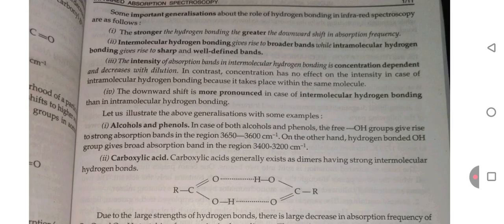Intermolecular hydrogen bonding gives rise to a broader band, while intramolecular hydrogen bonding gives rise to a sharp and well-defined band. The intensity of the absorption band in intermolecular hydrogen bonding is concentration dependent and decreases with dilution. In contrast, concentration has no effect on the intensity in the case of intramolecular hydrogen bonding because it takes place within the same molecule. The downward shift is more pronounced in the case of intermolecular hydrogen bonding than in intramolecular hydrogen bonding.